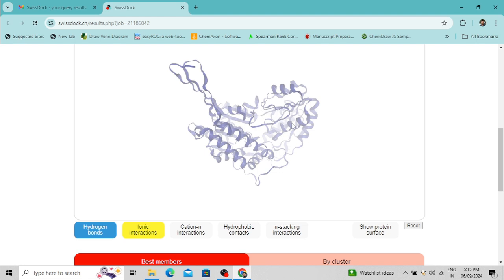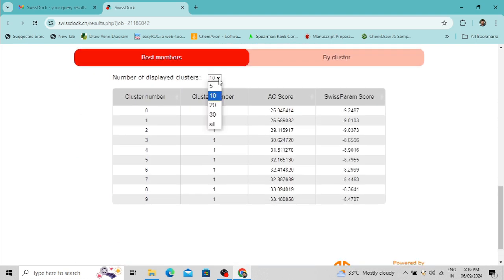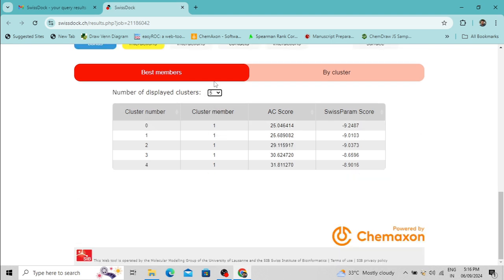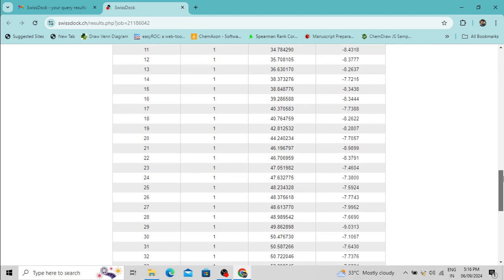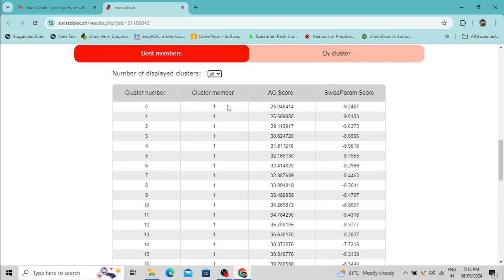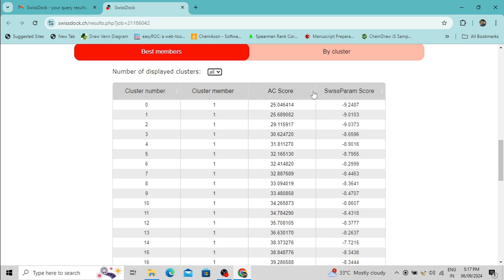Within this space, in several areas the ligand molecules can be docked, so we get many poses, and these poses are clustered based on their similarity. If you click 'All', all clusters will be presented and the score of the best pose of each cluster is shown. These poses have been scored through two different scoring functions: Attracting Cavities score and SwissParam score. The pose with the lowest score is the best pose — in this case it has a SwissParam score of minus 9.2487, making it the best pose.